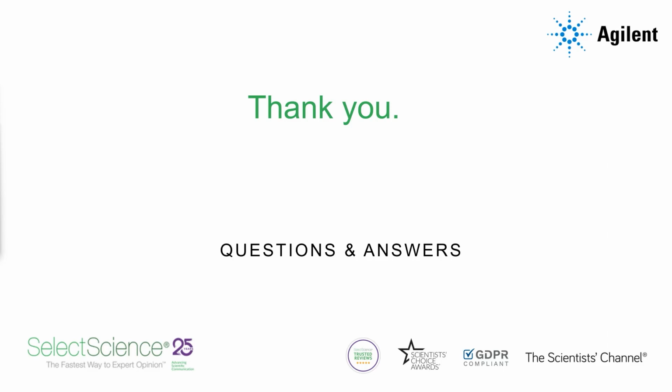Thank you, Barbara. Then I have another one here asking, does droplet generation increase the sensitivity of flow cytometry? I guess it doesn't increase sensitivity, but allows you to explore a different part of your experiment. Because you'll be able to then analyze the cellular environment, it means you can do that using flow cytometry. So you can analyze the full droplet in flow cytometers.